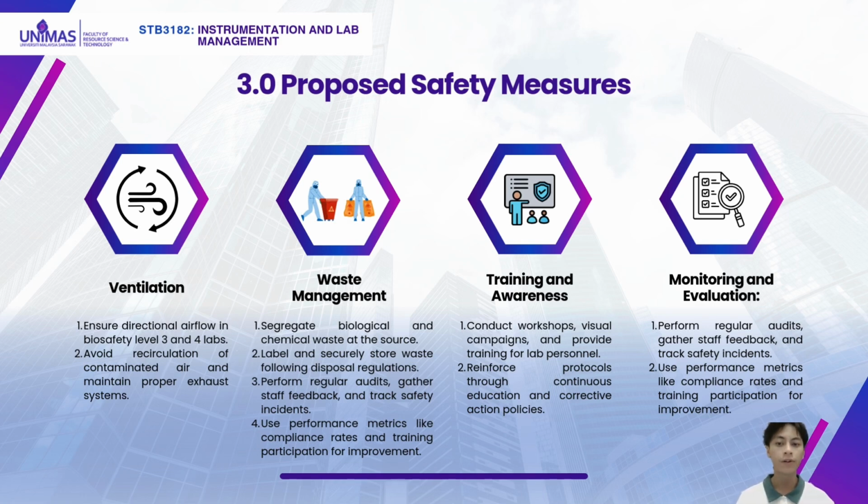An integral part of these measures is training and awareness. Comprehensive workshops, targeted awareness campaigns, and visual aids like infographics will reinforce laboratory safety protocols. Ongoing education ensures all staff are up to date with the latest safety practices and regulatory requirements, fostering a proactive safety culture. Finally, monitoring and evaluation are essential to sustaining these measures.